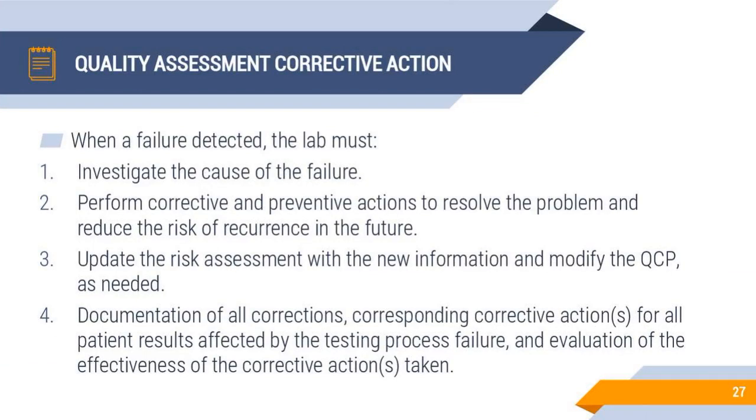If you find during review some error or you detect an error, what is the corrective action? Investigate the cause of the failure, perform a corrective and a preventive action to resolve the problem and reduce the risk of reoccurrence in the future, of course, and update the risk assessment with the new information and modify also the IQCP, as I mentioned, and document all these records, the corrections, the correspondence, corrective actions, and all patient results or whatever documented during the investigation. It has to be well documented and filed.